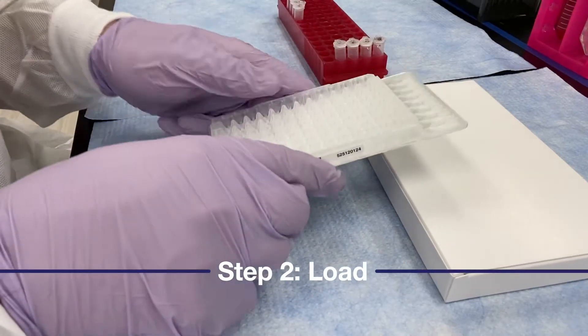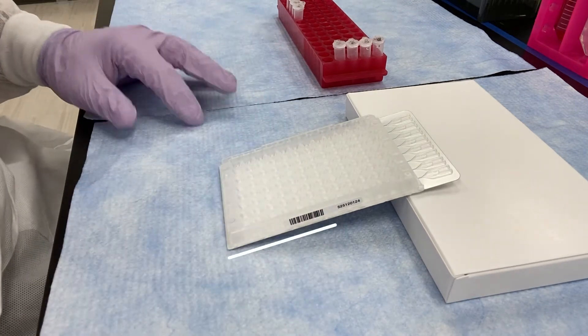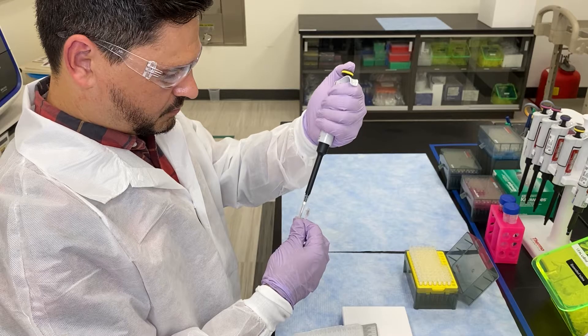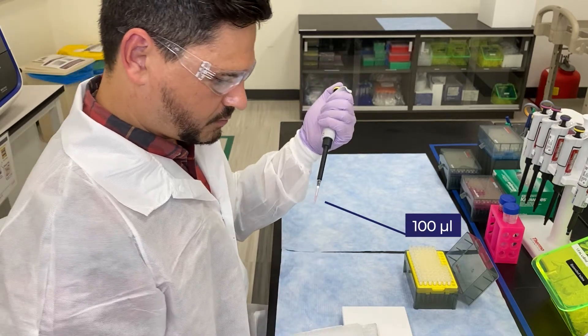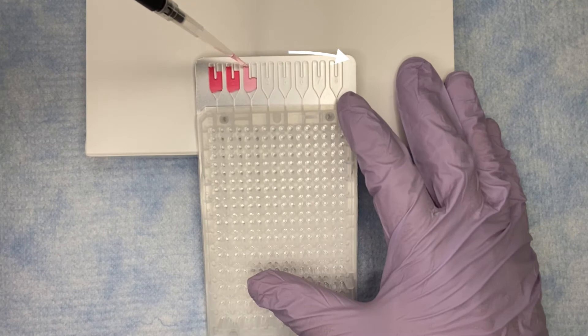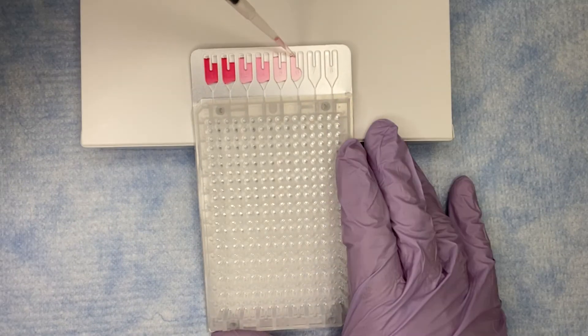Now it's time to load the card. I like to angle my card by propping it up on the packaging or a tube rack. I'm going to slowly dispense 100 microliters of reaction mix into each of the eight fill ports, making sure to not let the tip puncture the coated foil beneath.